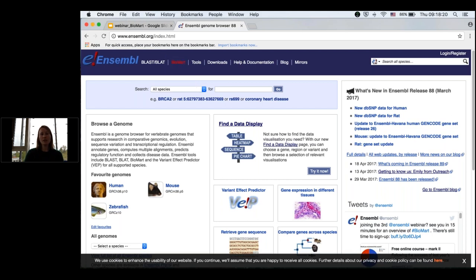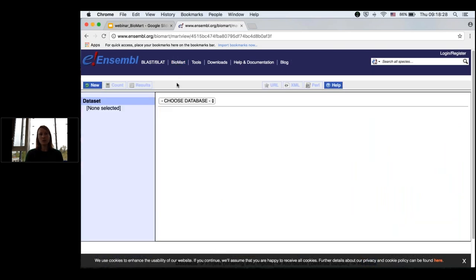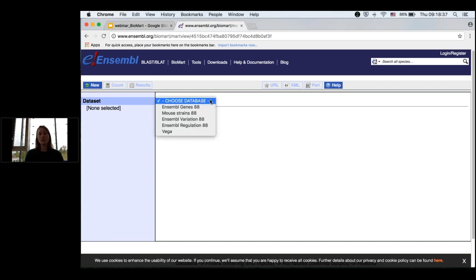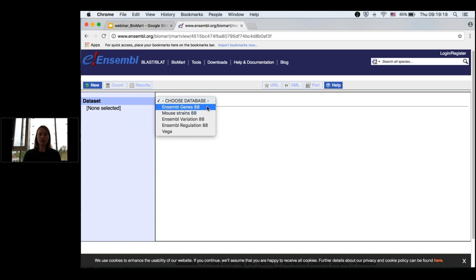There's a link to BioMart in the navigation bar at the top of pages in the browser — I'll click on it to load BioMart. It's already prompting us to select our dataset via a drop-down menu. We have options including Ensembl Genes 88, Mouse Strains, the Variation database, the Regulation database, and a Vega option. The number 88 refers to the current version of Ensembl. For our query, we're interested in plain GeneMart, so I'll go ahead and choose that.